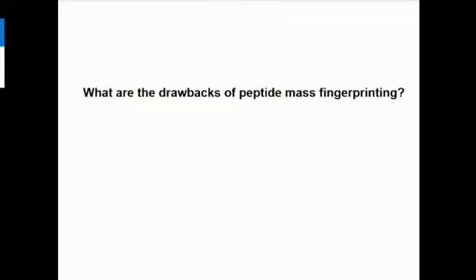Let's say you had those 2 peptides, okay, you wouldn't be able to distinguish between them in a peptide mass fingerprint because they've got the same overall mass. They've got the same amino acids but in a different sequence, and so they've got the same mass, they appear at the same place in the mass spectrum, you won't be able to tell the difference. So that would confuse the database search, and any hit that was returned, you could be less confident in.